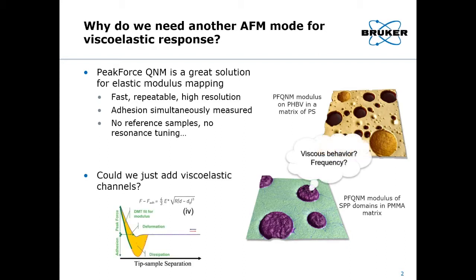So the question is, could we just add viscoelastic channels to PeakForce QNM? Well, really we can't do that, and it comes down to two things. Firstly, the frequencies are just too high in PeakForce QNM. And secondly, we're lacking a realistic model to quantify the key viscoelastic properties of storage modulus, loss modulus, and loss tangent.